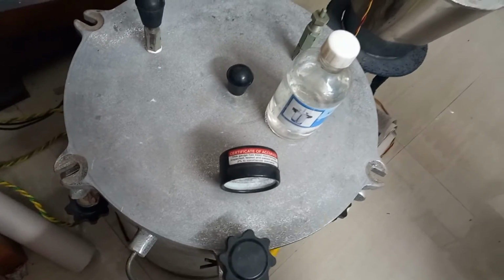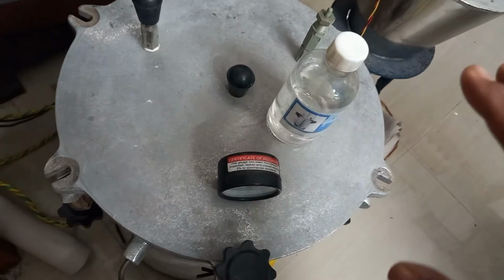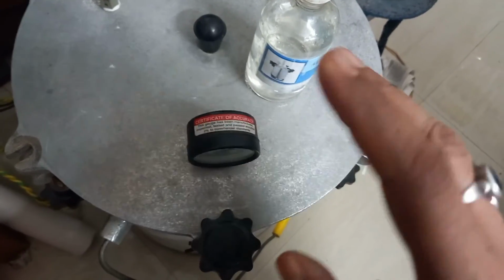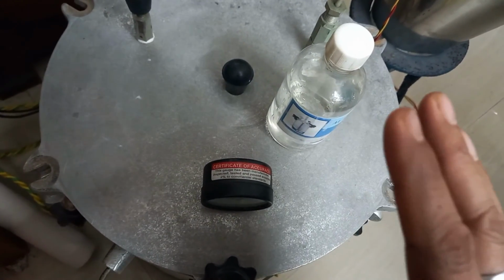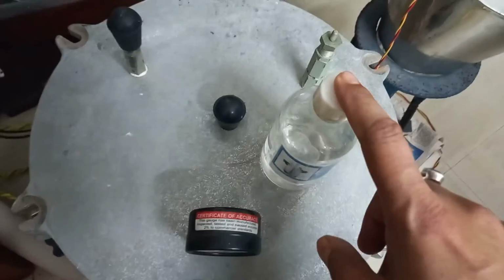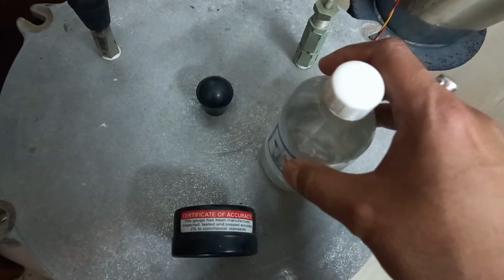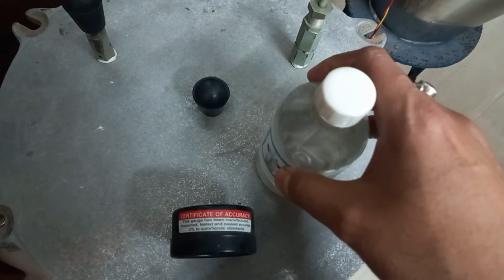If you pour this solution inside the water in the autoclave, and you just switch on the autoclave for 5 to 10 minutes and switch it off, then your autoclave will not only disinfect but also sterilize, because the chemical present inside is glutaraldehyde. Glutaraldehyde is a very good disinfectant and also a sterilizing reagent.